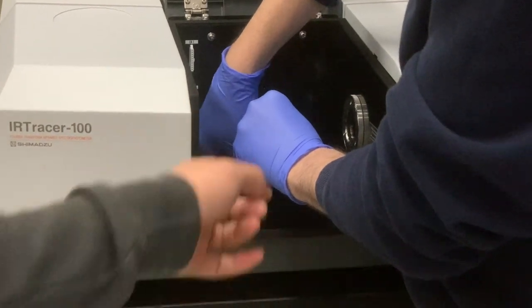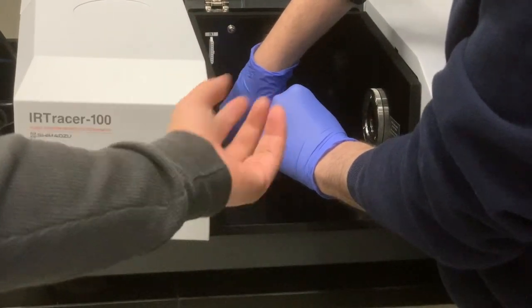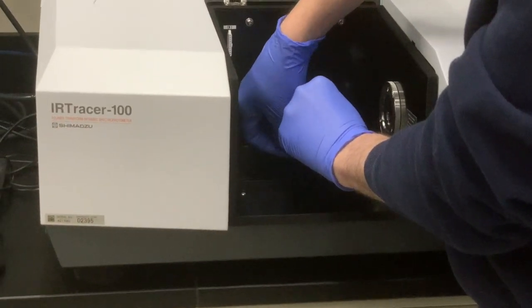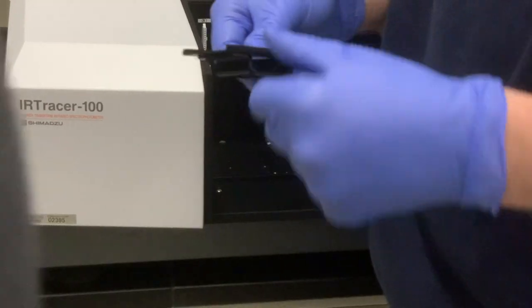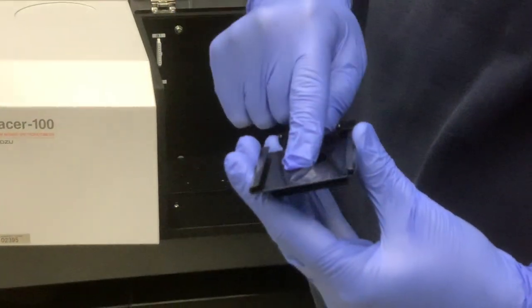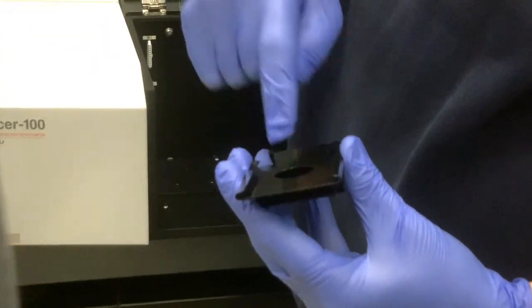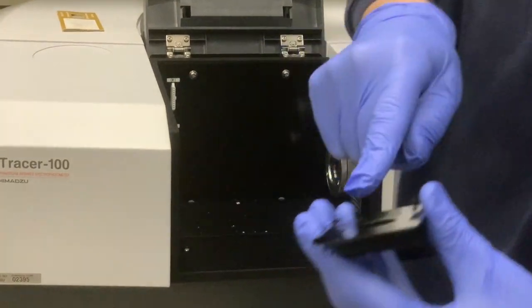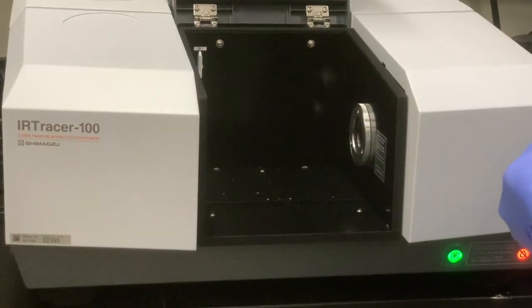You just need to remove the substrate. This one is just a very simple substrate support to hold that. I tried to find something to hold the circle, the silicon wafer, but it's not working properly. You see, when I put the silicon wafer, it just dropped down, so I have to put some tape. So I need to have another holder. I think the simplest way to mount it is just to use tape too.